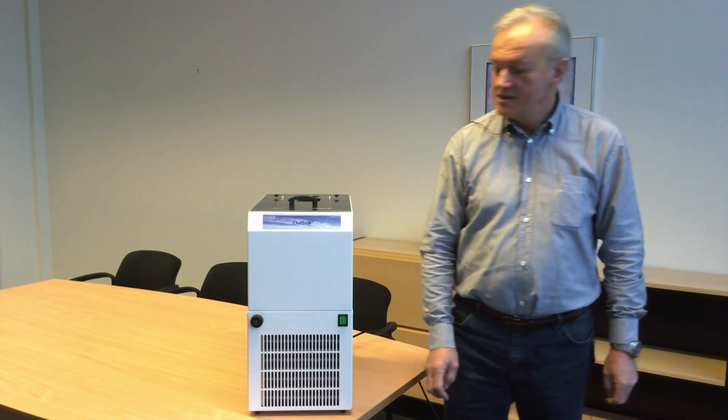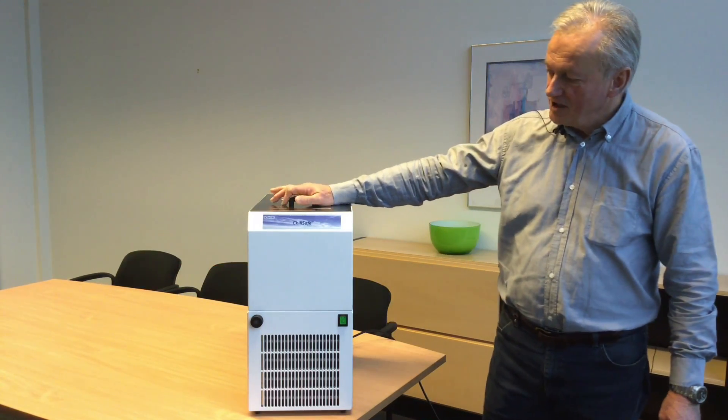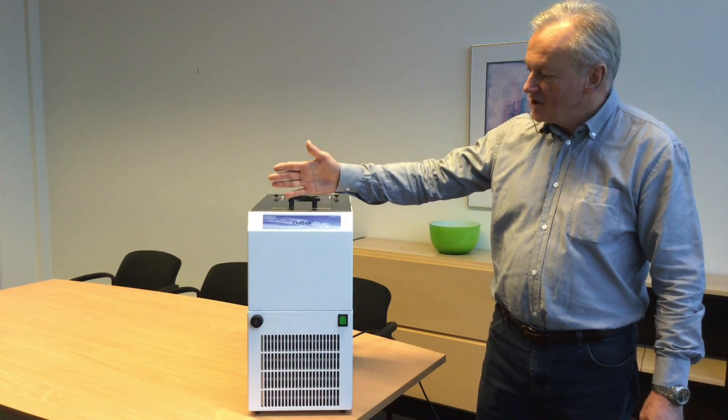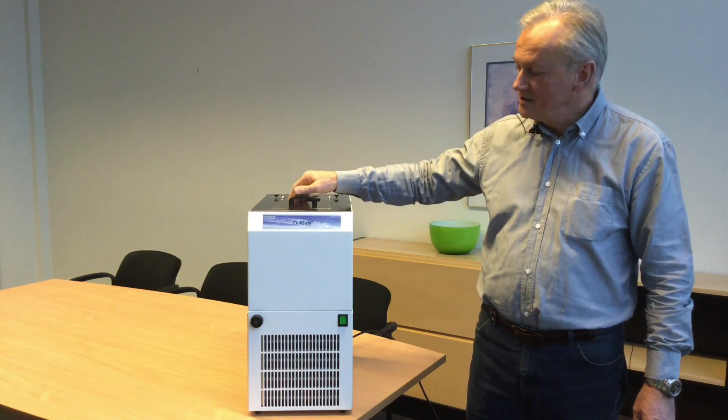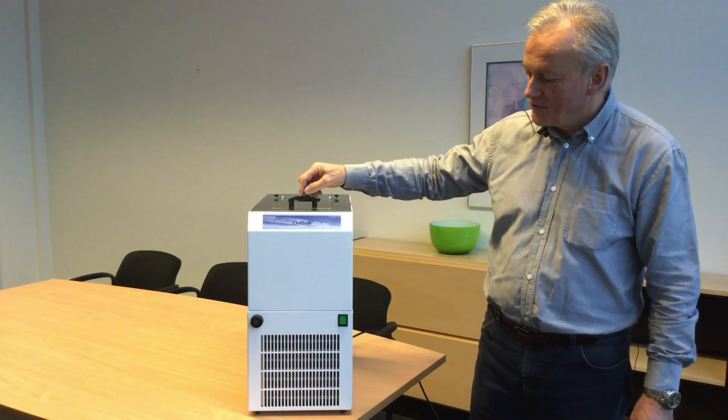Hello, I'm Jesper from Laberdeen. Today we will talk about our ChillSafe 830. ChillSafe 830 means it is a cooling bath with a volume of 8 liters and a temperature of minus 30.